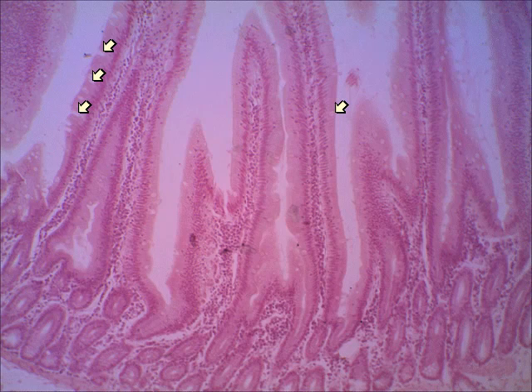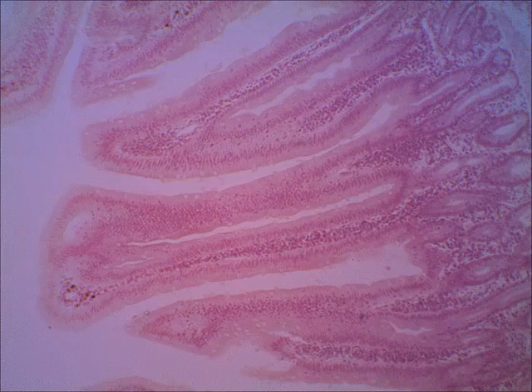You will see this in the small intestine. You also may have noticed this if you looked at the inner surface of the stomach on high power. You would also see the simple columnar epithelium. Remember, that's an absorbing epithelium. That's a major tissue of the digestive tract, because the digestive tract not only digests, it also absorbs.